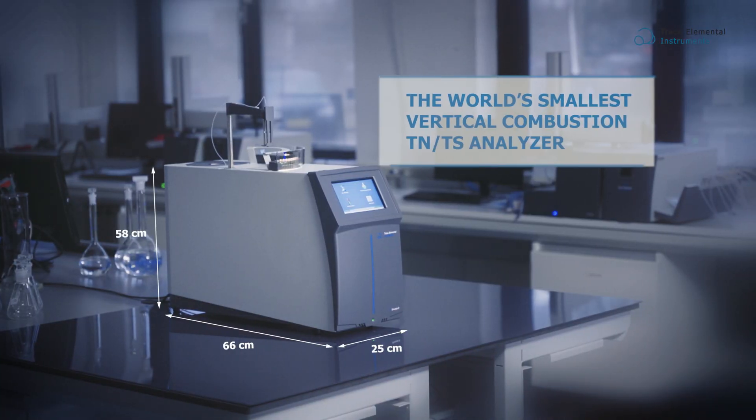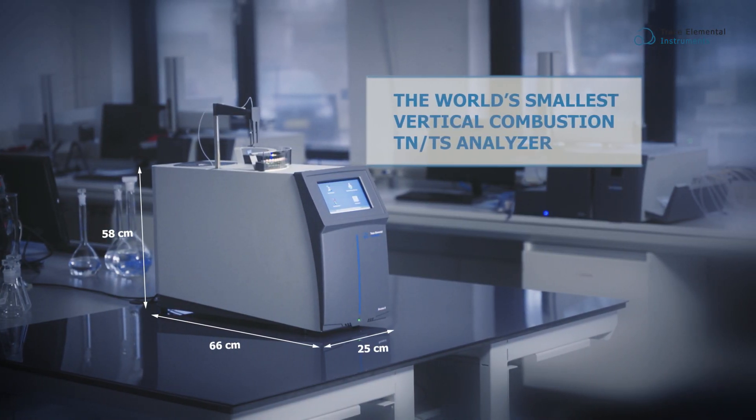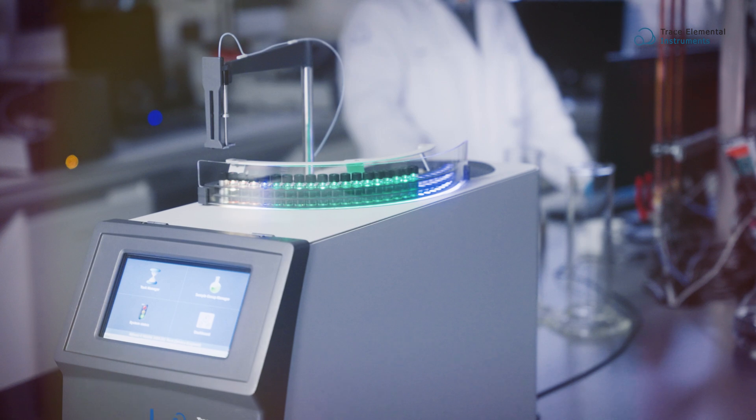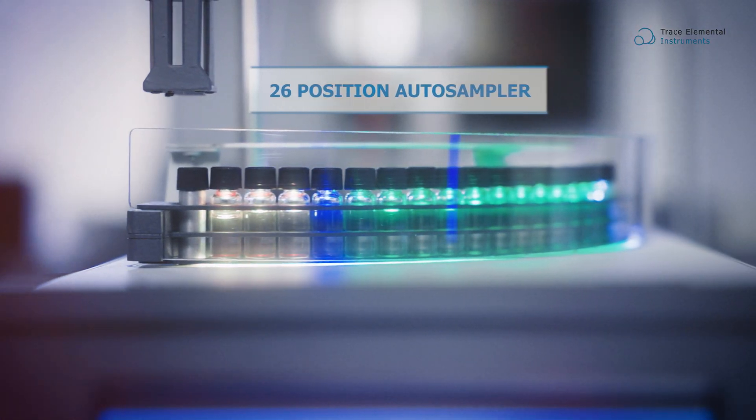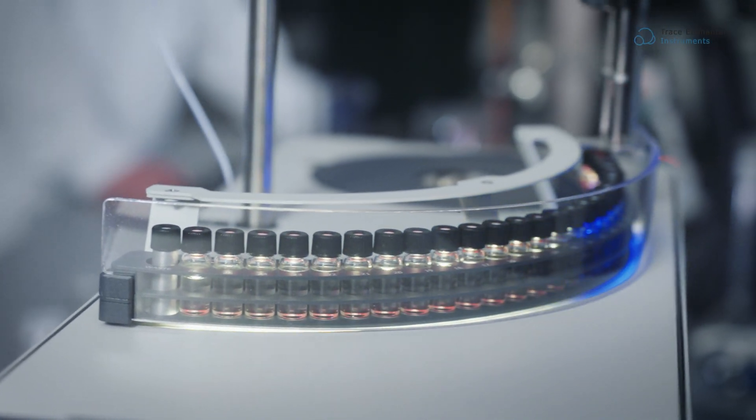It is the smallest TN-TS analyzer available on the market. An integrated 26 position auto sampler handles all the liquid movements, injections, and even dilutions.